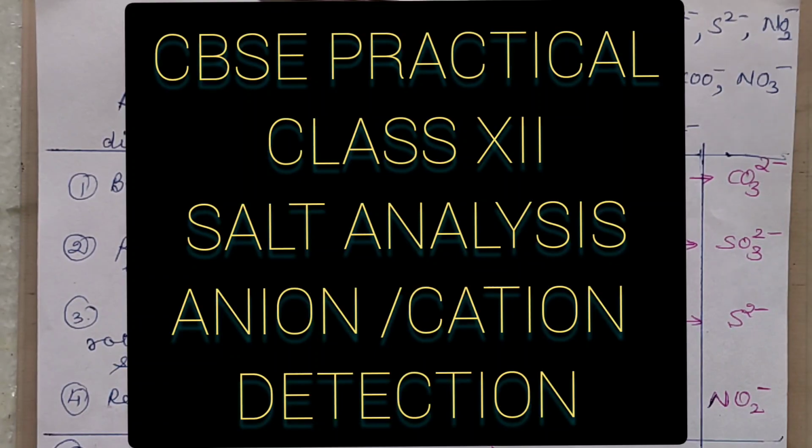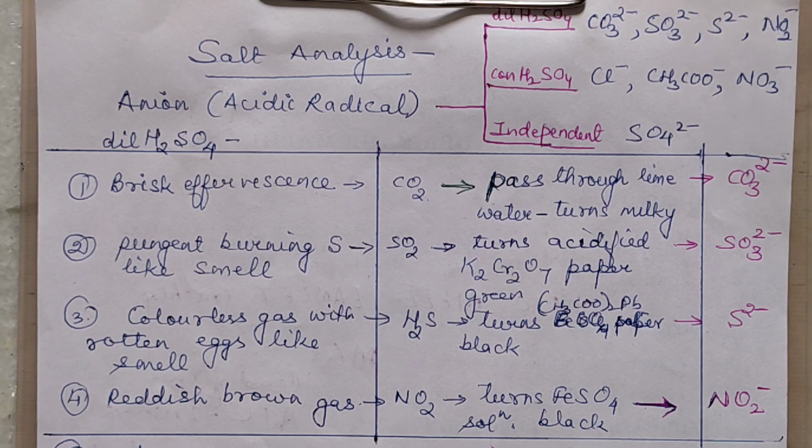Hello students, in today's video I will be discussing salt analysis. Since your practicals are coming, you should be well prepared with 3 sets of experiments, that is salt analysis, volumetric and content based. Volumetric experiment, how to perform that, I've already posted the video, please watch that. In today's video I will be completely explaining salt analysis.